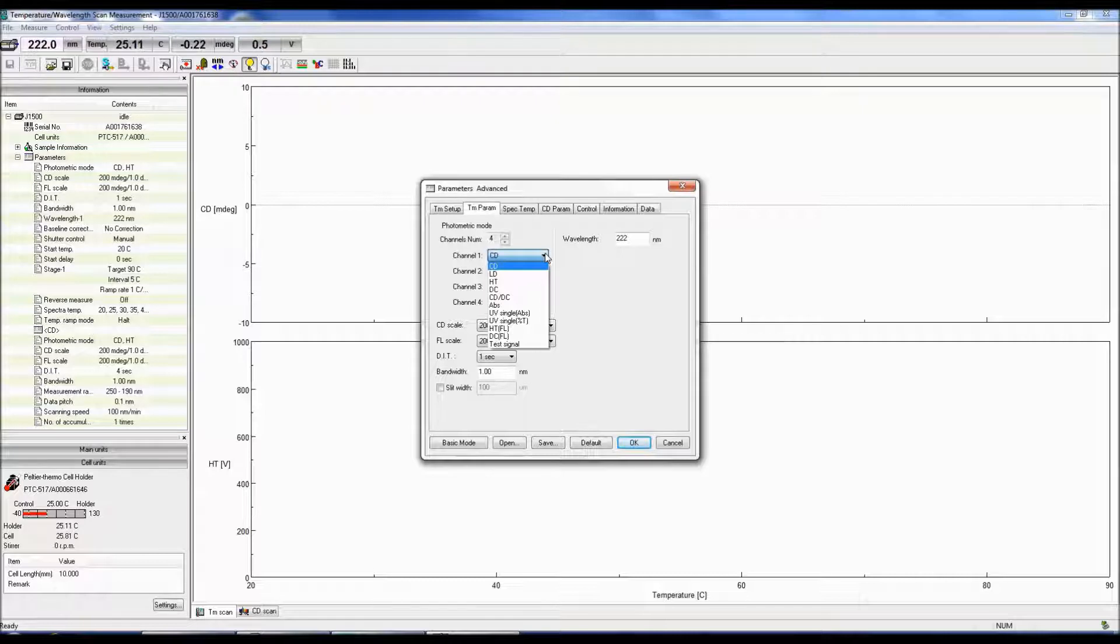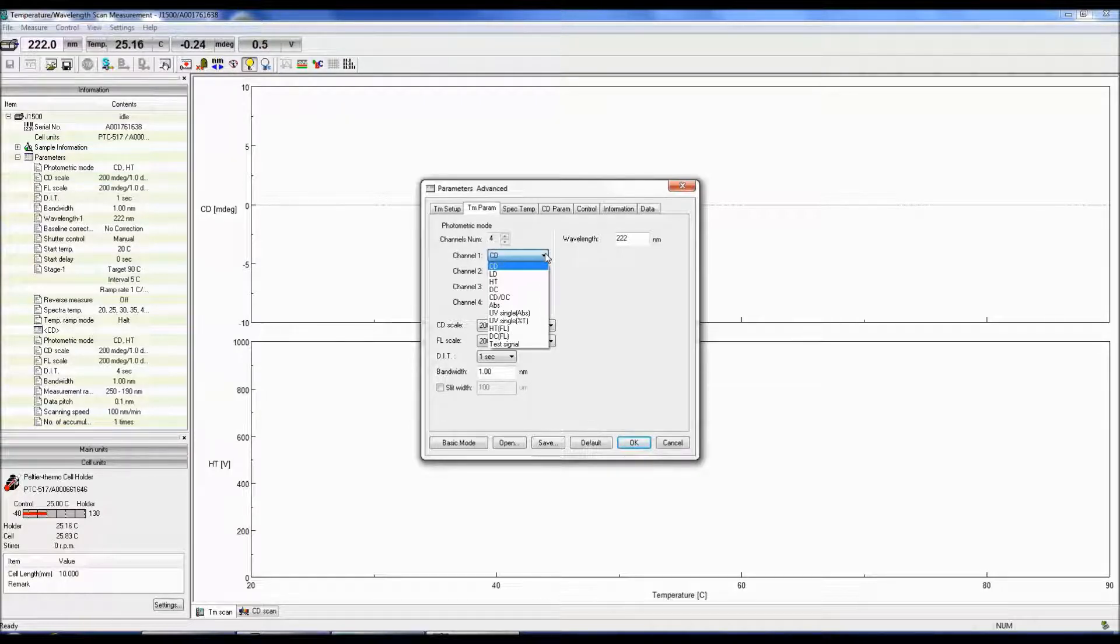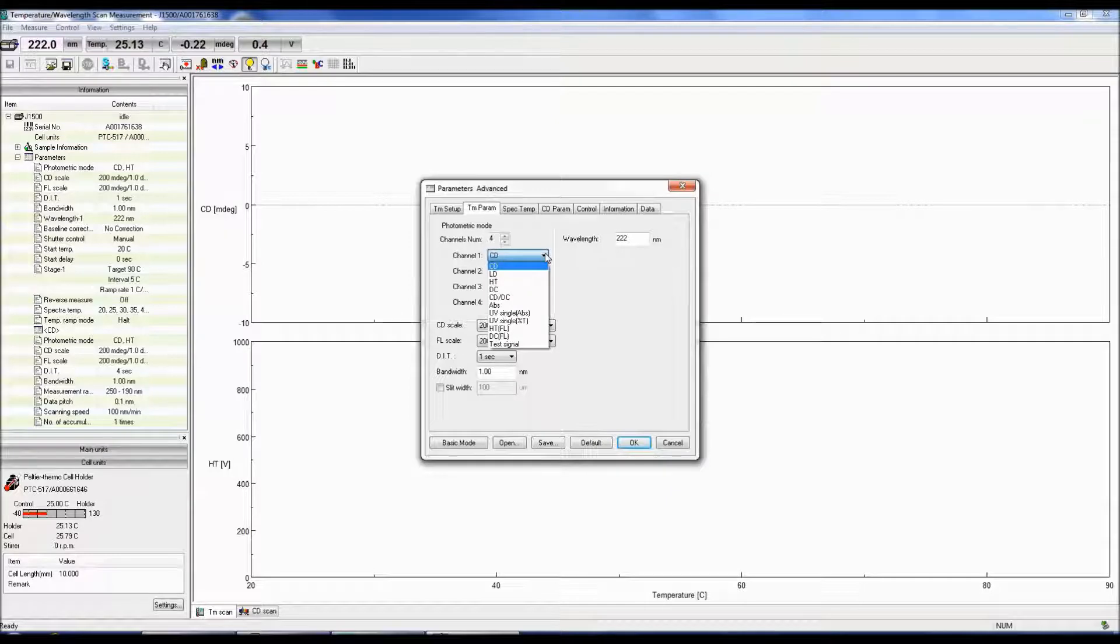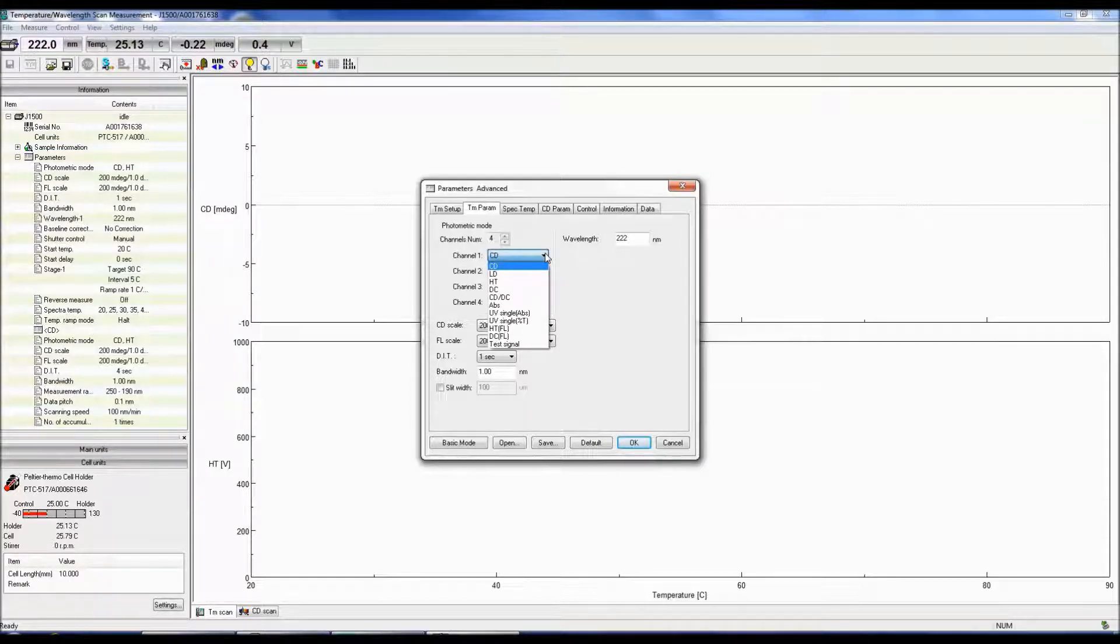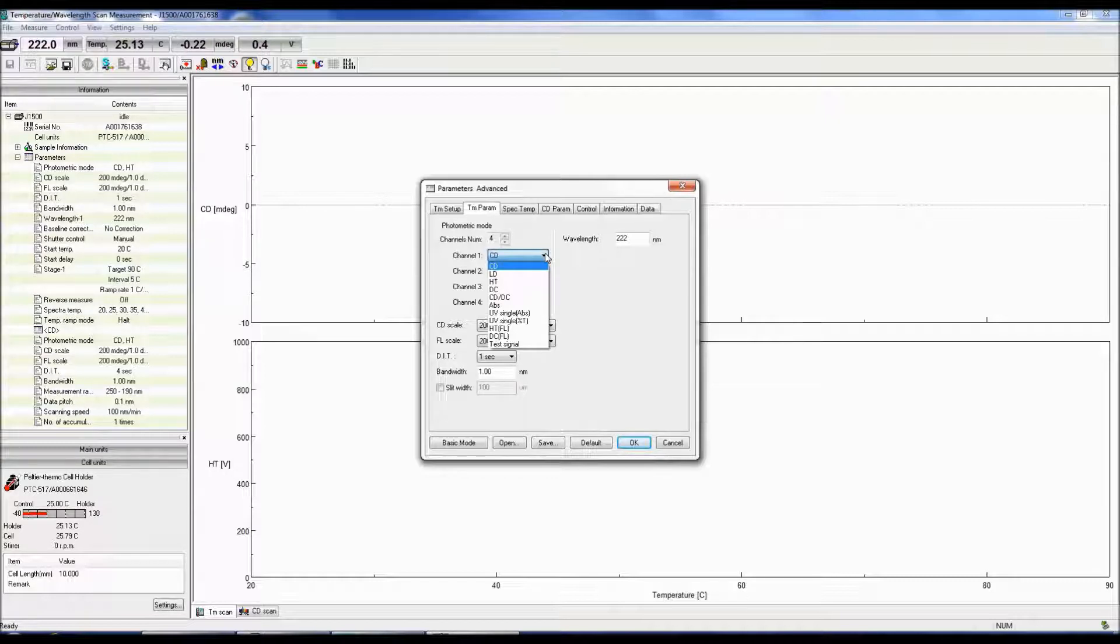CD over DC is the same as the CD signal when DC is set to 1 volt. This mode is useful when the DC varies with the sample absorption and the HT is fixed. The absorbance can also be calculated from the HT voltage, while UV single converts the DC signal to either absorbance or percent transmittance.